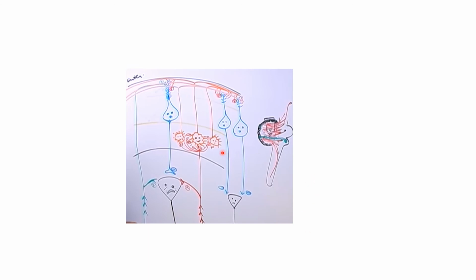Coming to this, it is showing a Purkinje cell getting excitatory impulses from the granule cell fibers. This is one of the granule cells which has divided into a number of fibers, divided horizontally and making synapses with the Purkinje dendrites.